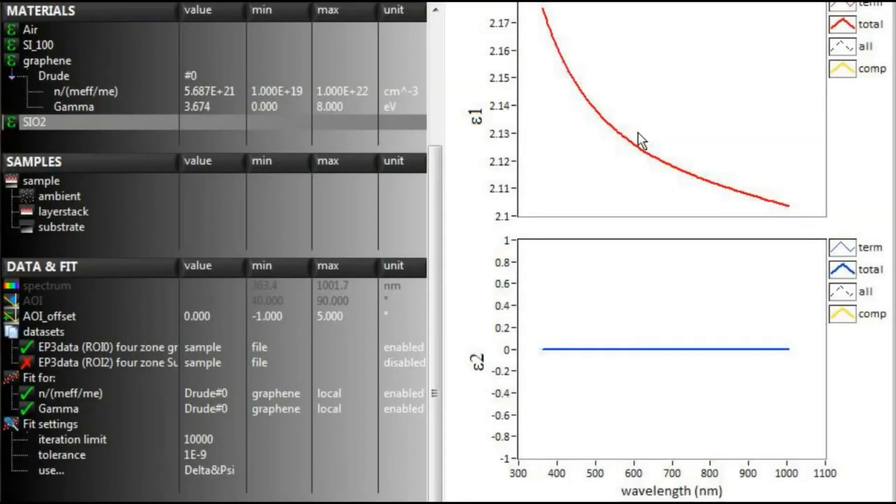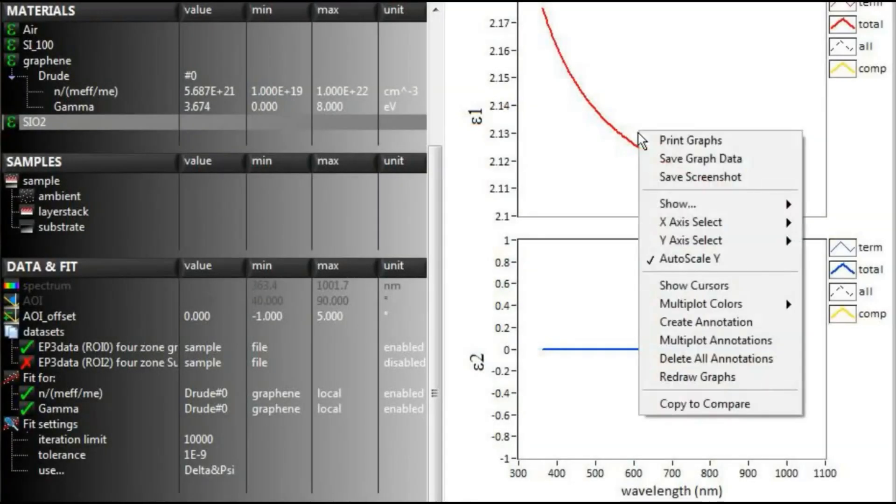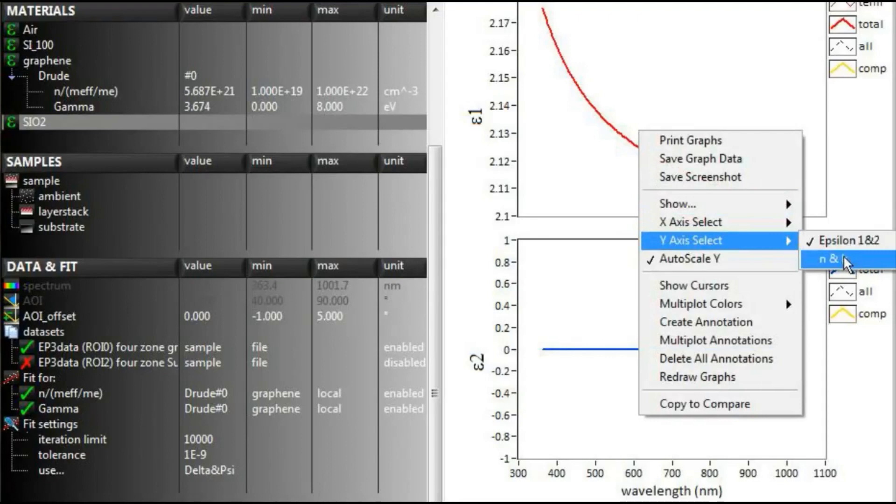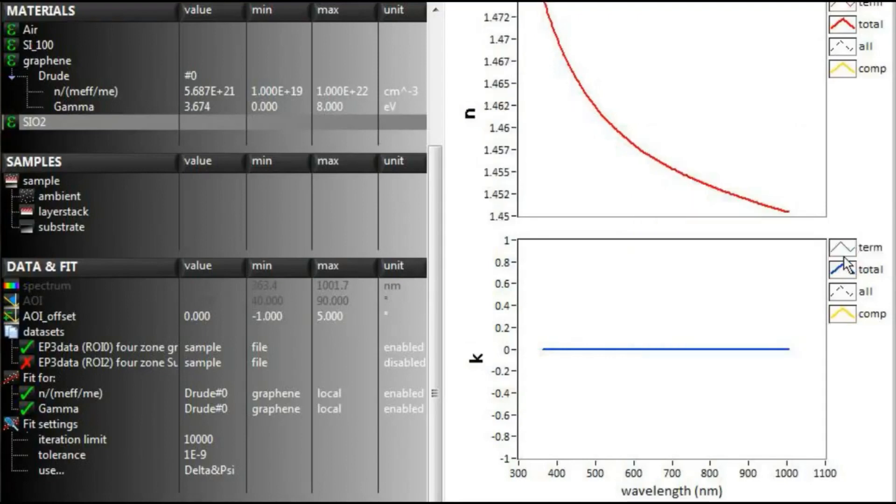As a material is defined, its dispersion will be displayed as a function of epsilon 1 and 2, or as a function of n and k.